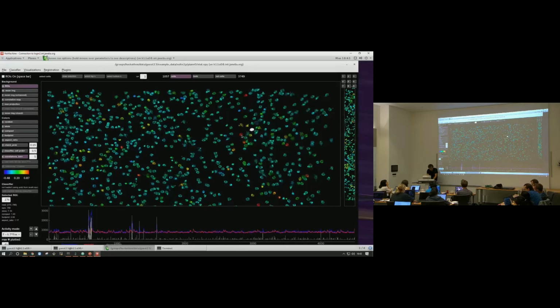If you keep Control pressed, then maybe you'll have better luck than me. You should be able to select multiple regions of interest. Shift click also works now, I implemented it. But it doesn't work here. I don't know if it's because it's a remote machine and keyboard shortcuts are not forwarded. Why don't you do the top 10?